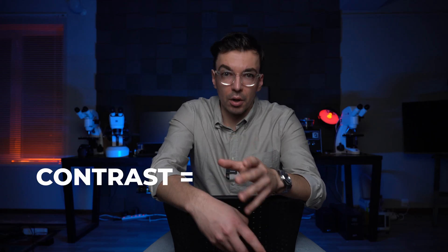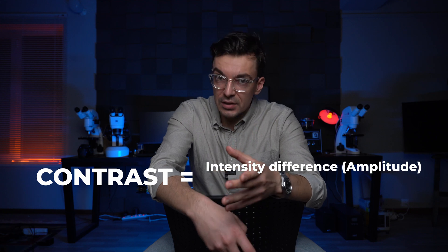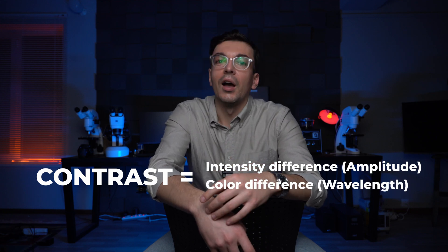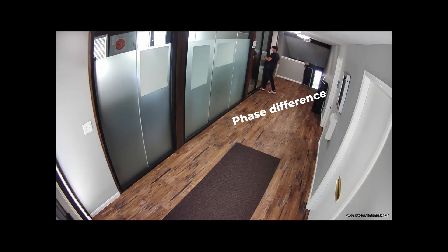So in microscopy the contrast is difference in intensity, amplitude or a difference in color wavelength. Unfortunately our eye can't see the phase difference. We cannot determine the phase of the light wave.